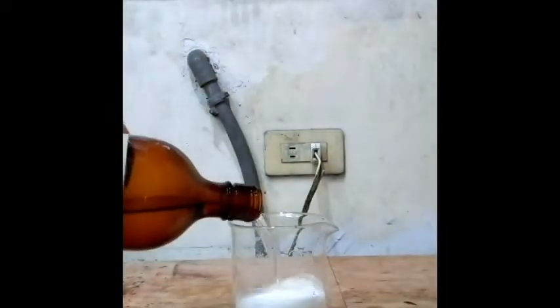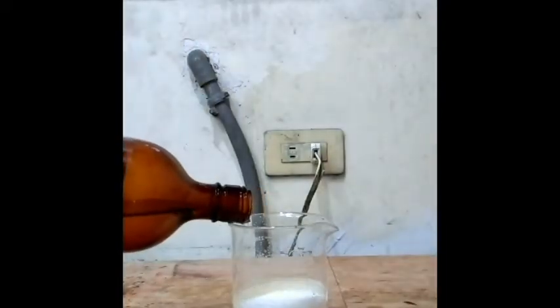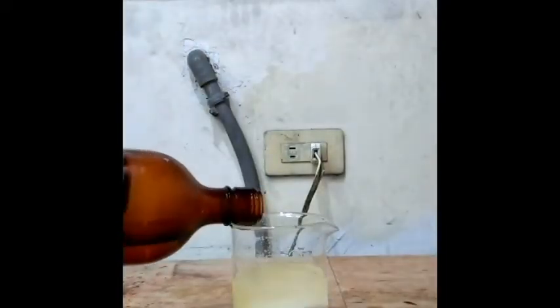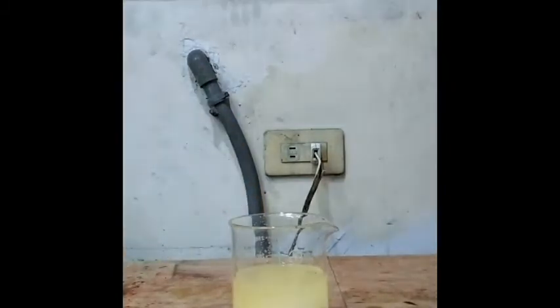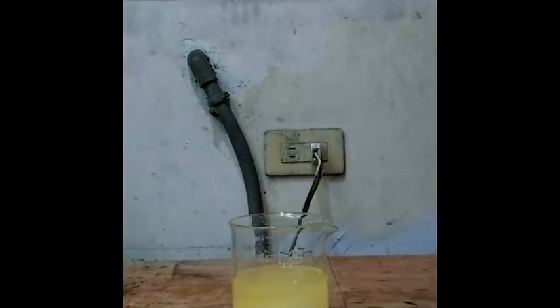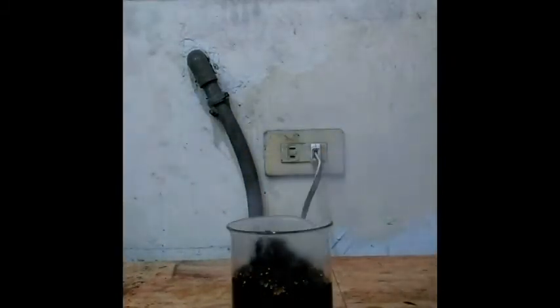We put some sugar in the beaker and pour some sulfuric acid in it. Soon, the dehydration process starts forming a carbon rod. This demonstration is often called sugar snake.